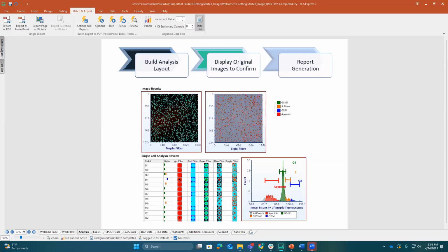As you can see, today I am presenting from FCS Express, and that can be really useful too, because if you need to do a short little meeting with your lab, you can just present from your FCS Express, so then you don't have to create any exportables either.